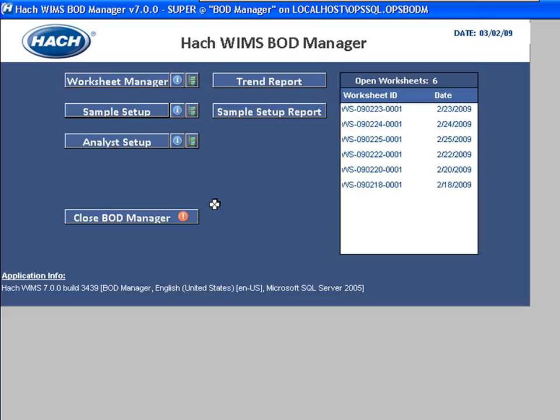This is Scott Dohner with the Hach Company. I'm going to be taking you through how to use sample setup in the BOD Manager. Sample setup is used to configure the system to tell the BOD Manager worksheet what types of samples you run.